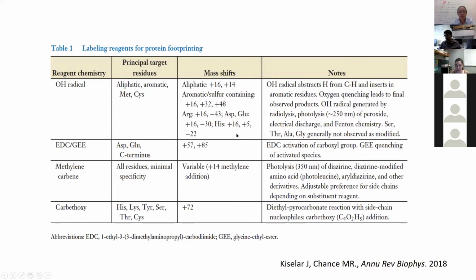So basically you can label like 17 out of 20 residues, but typically we observe about 12 out of 20 routinely in mass spectrometry. So for various reasons, because some residues have very low reactivity and it's hard to label them. So maybe again, as Sayan said, the jet will help us to also label those very low reactive residues. So the mass shift of product we generate in this chemistry is quite complex for data analysis.